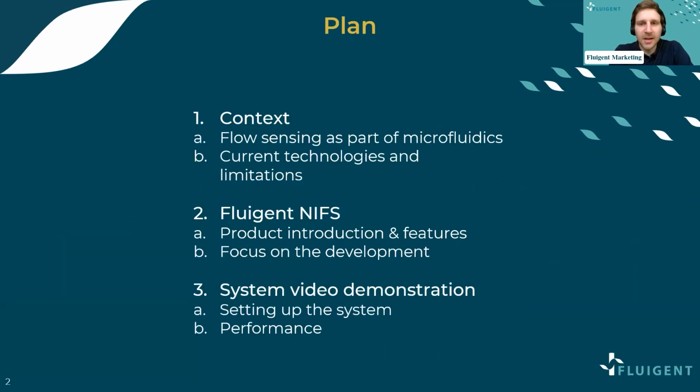So here's the timeline of the presentation. First, we will discuss why flow sensors are highly important for microfluidics and millifluidic applications. And we will discuss the main technologies that are available today on the market and what their advantages are, but also what their limitations are.